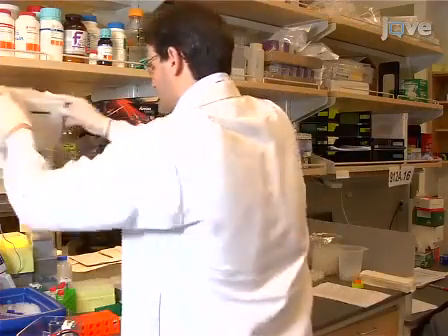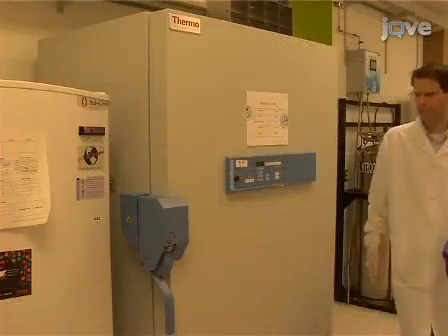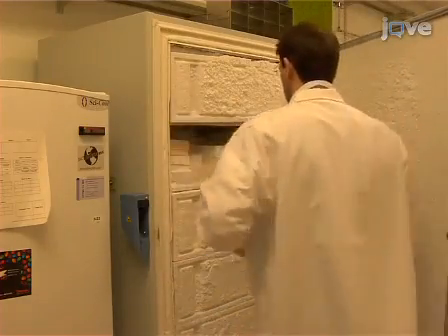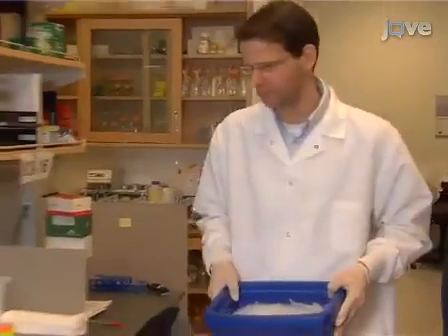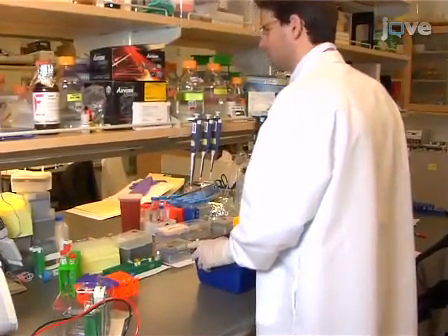Begin with RNA that has been extracted from serum using an RNA purification kit, or phenol-chloroform-based RNA method from homogenized tissue like Trizol. All extractions must be followed with a wash step, and all storage is done at -80 degrees Celsius. Concentrate the RNA solution if starting with a limited amount of sample, such as from serum.